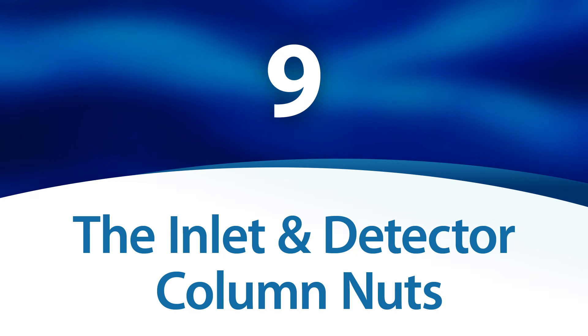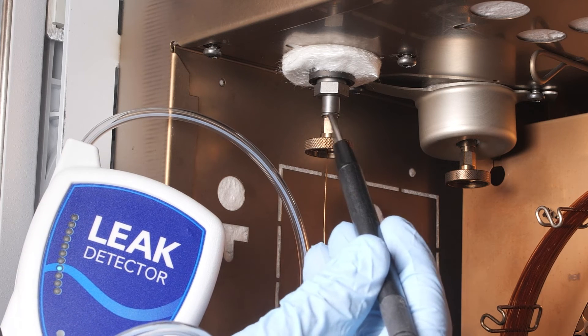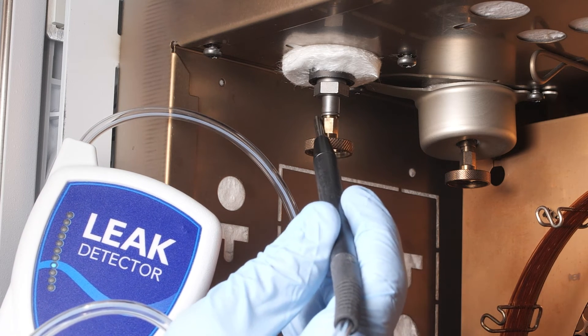The inlet and detector column nuts. Be sure to check the column nuts and fully tighten them if there is a leak. A damaged ferrule could also be the source of the leak and might need to be replaced.